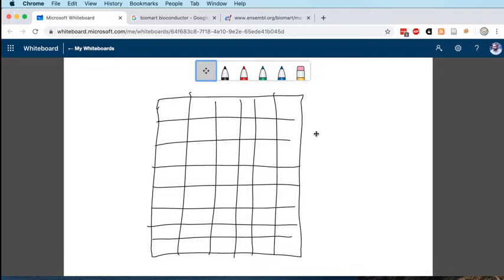And so the heat map colours the cells according to the expression of that gene in that particular sample. So we're going to have 141. I'm not going to do red and green, but we would have all of these cells, all different colours, depending on the expression of that gene in that particular sample.